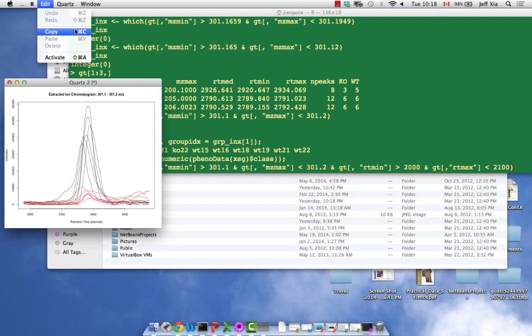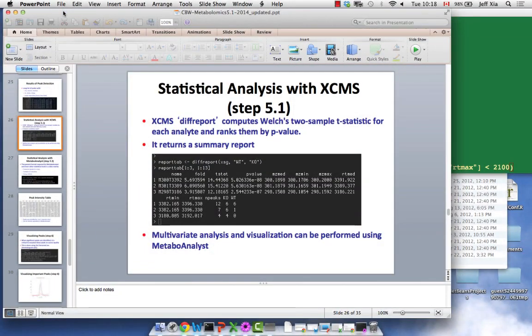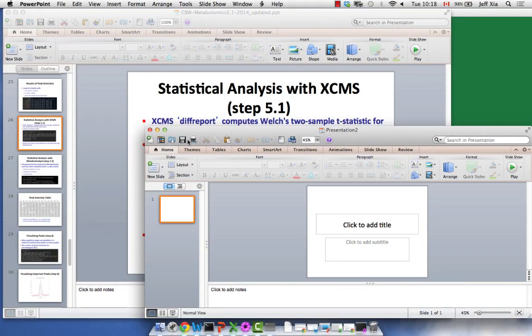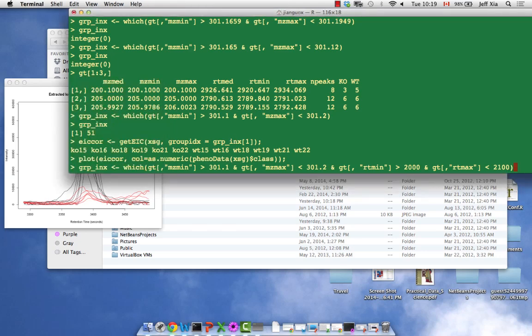That's a good question. In R, you can copy the image and paste it on PowerPoint, then generate a new image and keep pasting them one by one. This is just basic and intuitive. R does have a function for new plot windows, like MATLAB, and I'll show you. If you really want to learn the programming way, I can show you some basic commands to plot that.